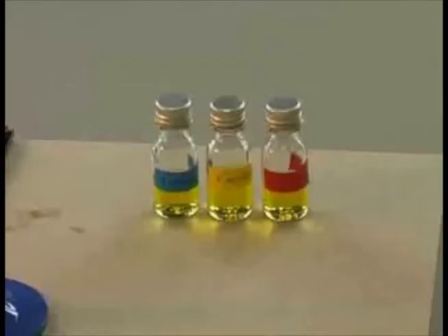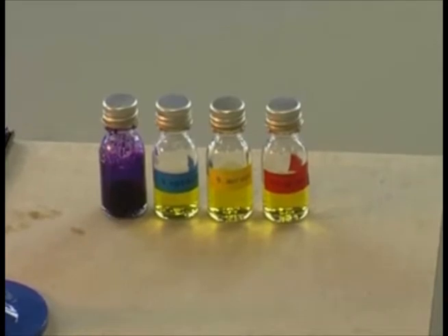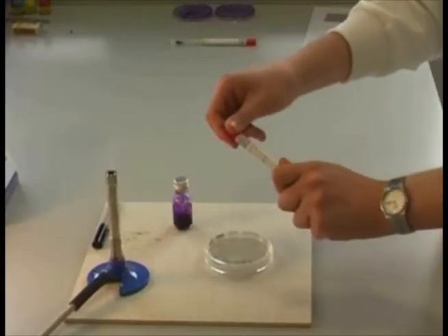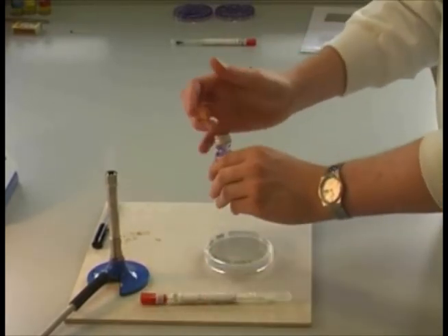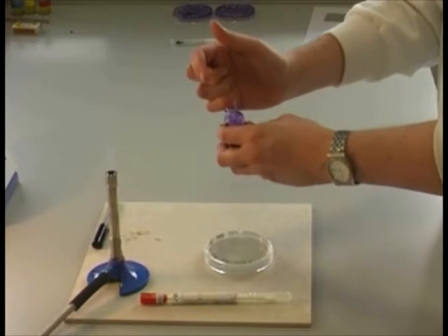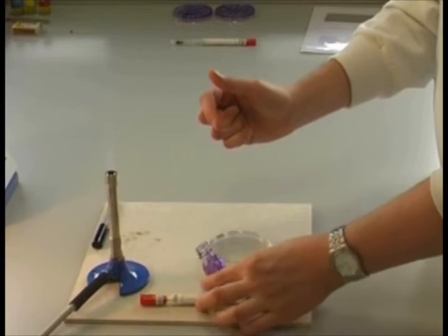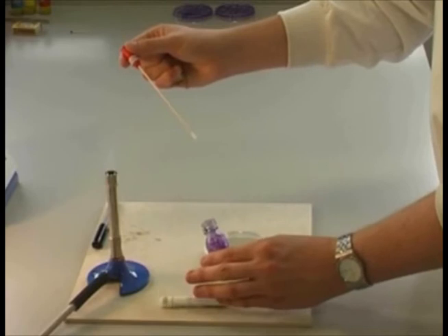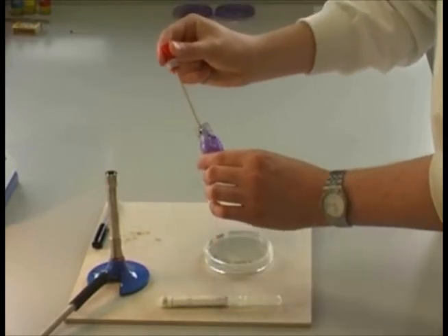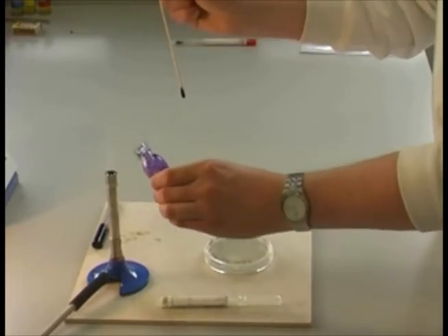Next we will be using different bacterial cultures to swab our plates with. The purple solution is a substitute for illustration. Prepare and partially remove a sterile swab from its container. With one hand, carefully remove the top of the culture bottle and flame the neck of the bottle only, not the lid. Without putting down either the bottle or the lid, dip the swab into the culture and carefully flame the neck of the culture bottle again, replacing the lid and proceed with streaking.